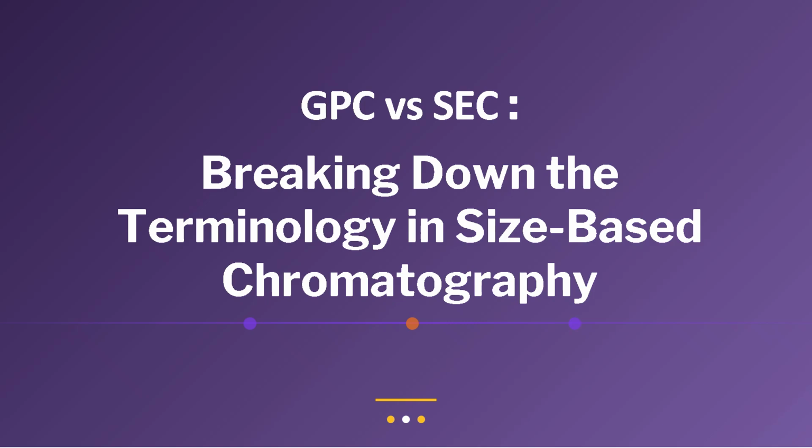Before we jump into today's topic, let me ask you something. Have you ever heard two scientists use the terms GPC and SEC like they're talking about two different techniques? Well, here's the twist. They're actually the same technique, viewed through different historical and scientific lenses. In this video, we're breaking down the terminology in size-based chromatography so you can finally understand the difference, the story behind it, and when to use which term.